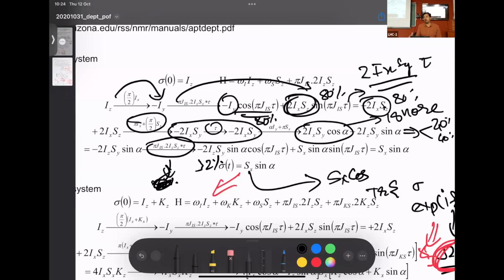Luckily, we live in an era where technology is so good. We can have excellently timed pulses, which are very, very good. Hardware has improved so much in the last 30 years, thanks to radio technology. So we still have very good stuff right now, but people used to try to minimize delays, minimize pulses to get the best information that they could get.